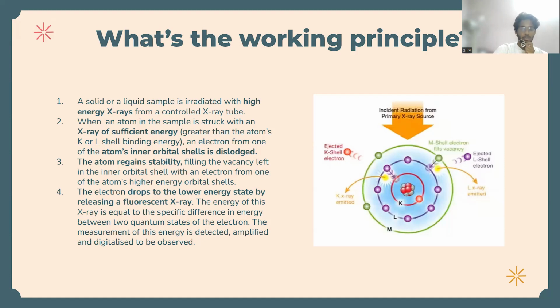As the X-ray energy reduces and approaches the electron's binding energy, so the yield of expelled electrons increases. Just below this binding energy, a drop in absorption is observed, since the energy is not sufficient to emit electrons from that shell and is too high in energy to emit electrons from the lower energy shells. It was also observed that not all the incident X-rays result in fluorescence. The fluorescence yield is the ratio of fluorescent X-ray to incident X-rays.